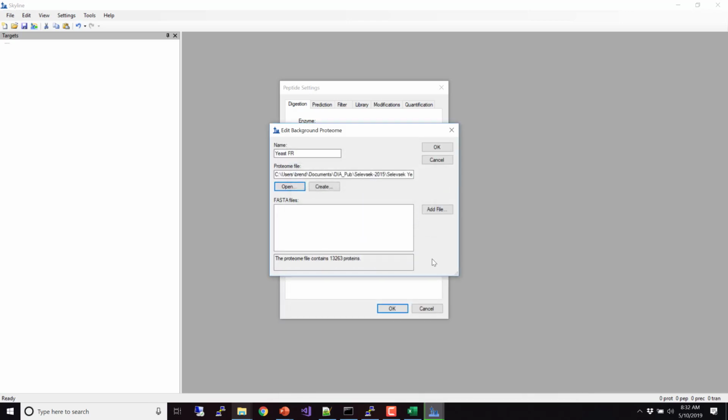So these can be valuable resources you can share. Here's a question I have for everybody. What do you make of the number of proteins? What do you expect of the number of proteins? Yeah, that's more proteins than yeast has, but oh, whoops, wait, we're expecting reverses in there. So it should be twice as many. Exactly, yeah, what's the 3? And so, yeah, I don't know.